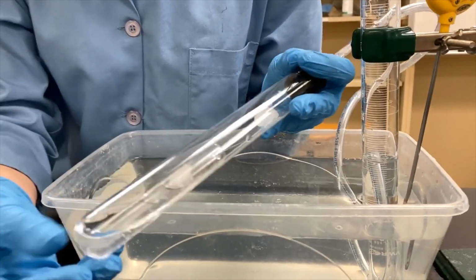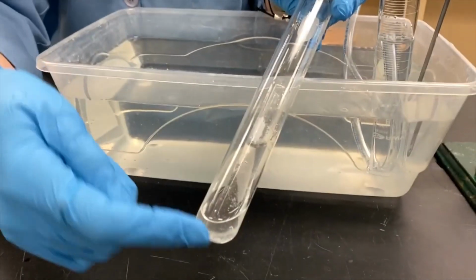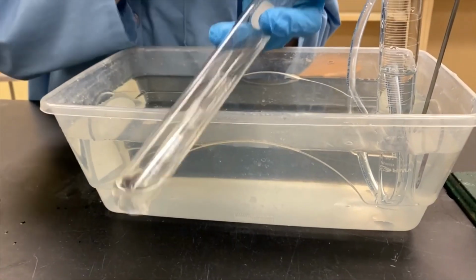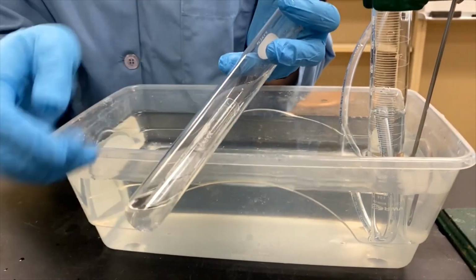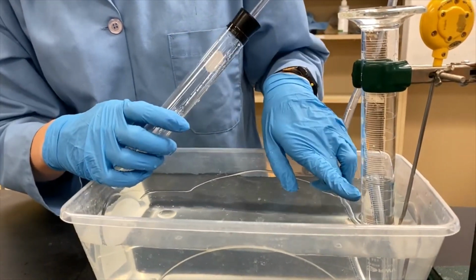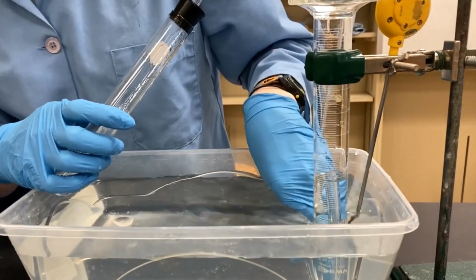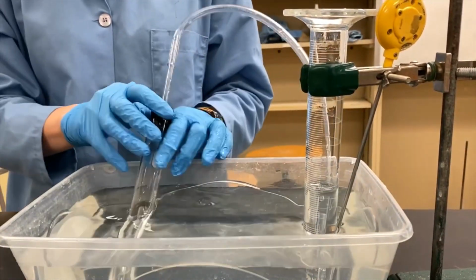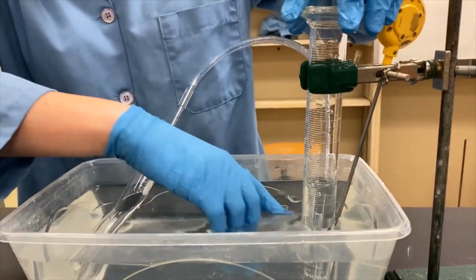All right, but now if you look, our solution is relatively clear and colorless. The bubbles have stopped being produced and it's pretty much out of our system here. So now what we can do is record our final volume of our gas here. So this is just like reading the volume of a normal graduated cylinder. It's just upside down.